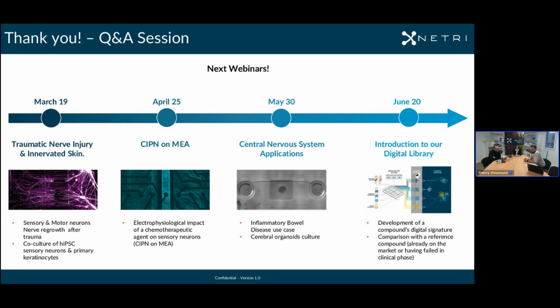Another question: under basal conditions, do you need to add any growth factor or so to promote neurite passage to compartment 3? So the neurons that we show you, they do have growth factors and neurotrophin in the media, but here we don't need to have a gradient of growth factor to promote the growth.